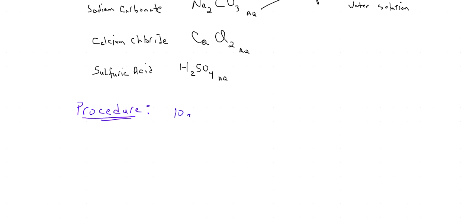milliliters of sodium carbonate, okay? And we're going to measure this in the graduated cylinder. Sorry, my silly picture.